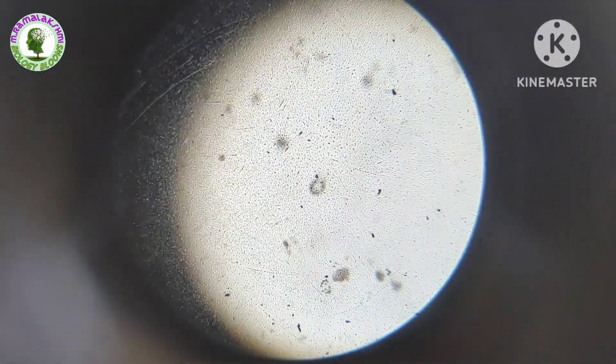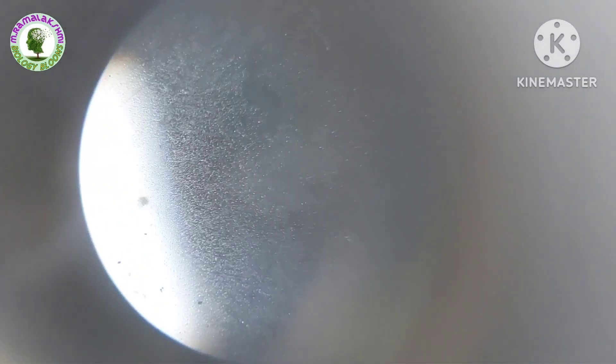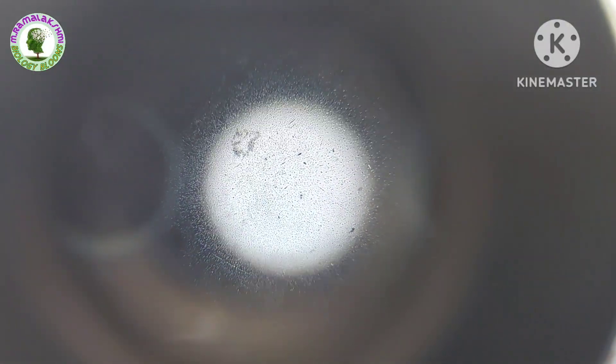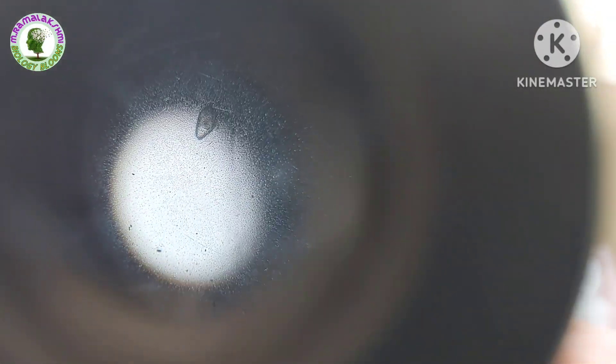What are they known as? Micro-organisms. And another name is microbes.